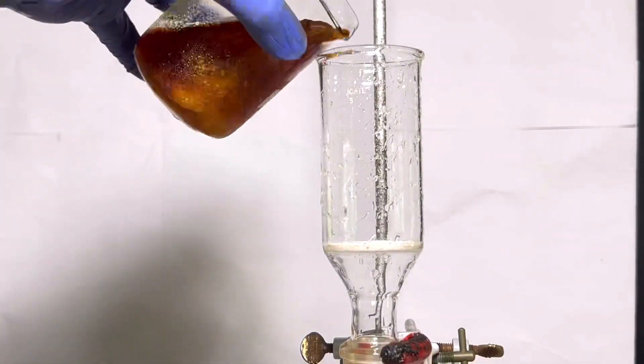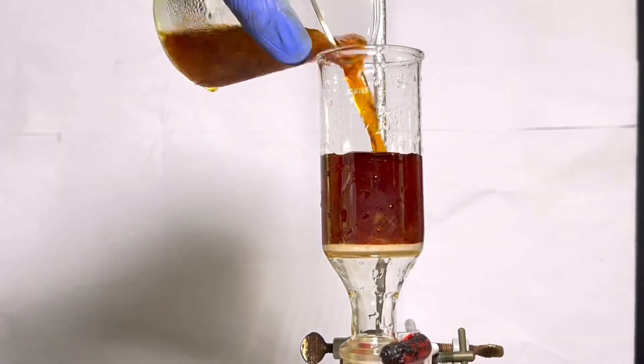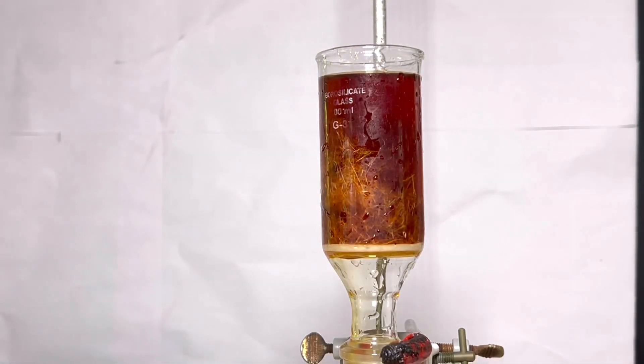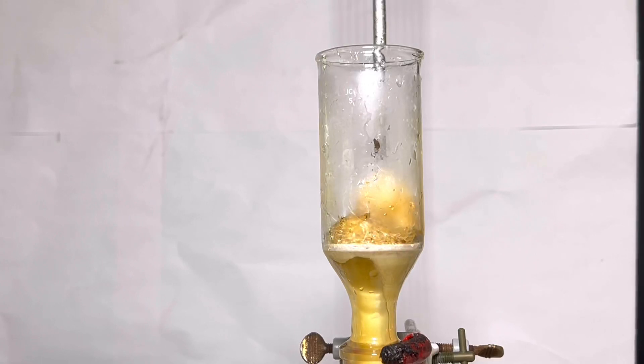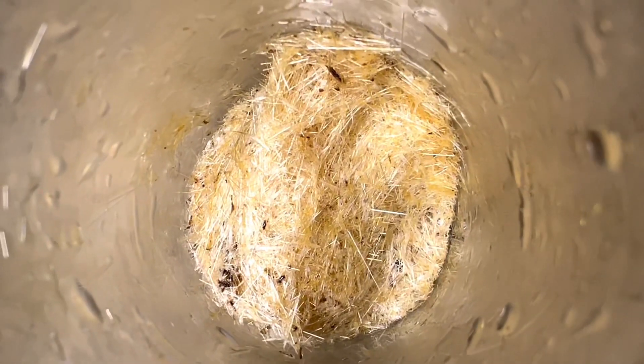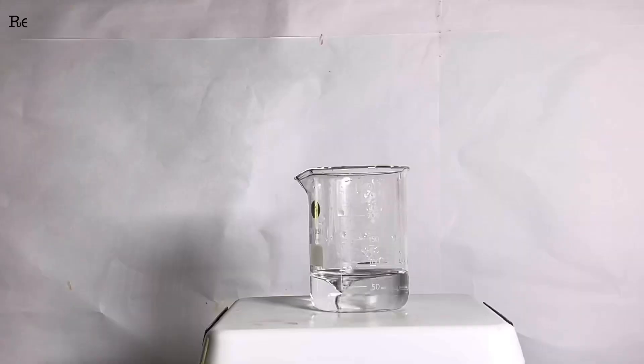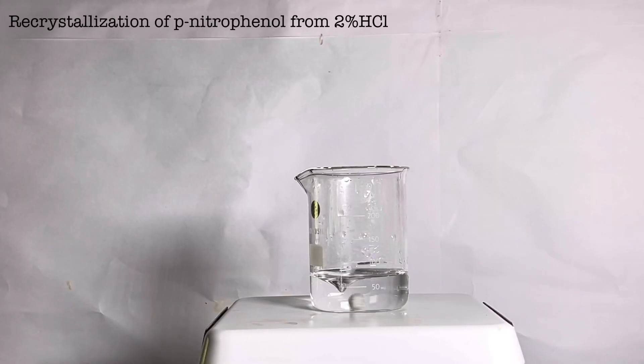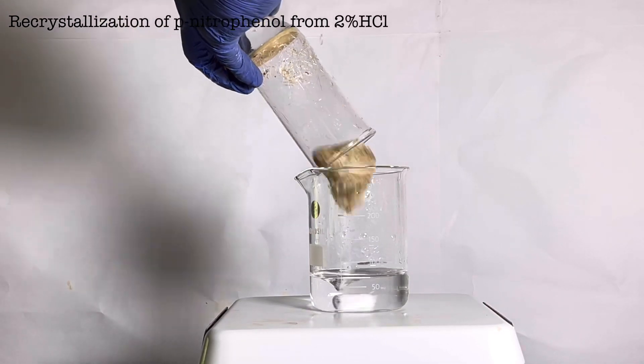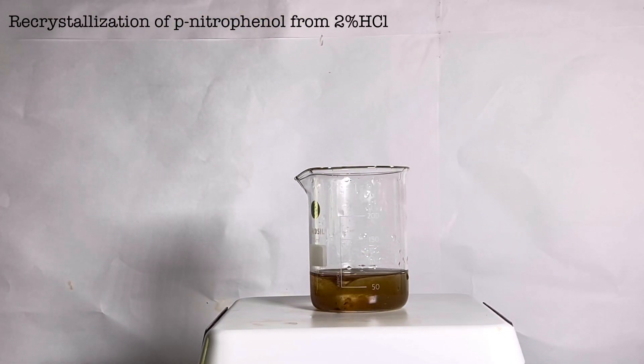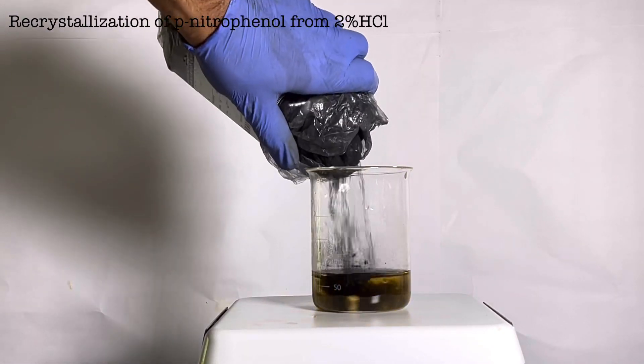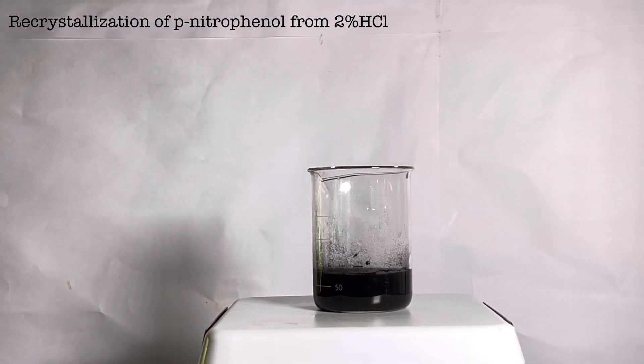Next, I take the para-nitrophenol crystals and transfer them to the Buchner funnel. Filtration was done and the crystals were white, but lots of impurities were present. So I decided to recrystallize it from around 60 ml of 2% hydrochloric acid. The para-nitrophenol dissolves very quickly in hydrochloric acid. Now activated carbon is dumped in it. The solution was boiled for few minutes and then filtered hot to remove the carbon.